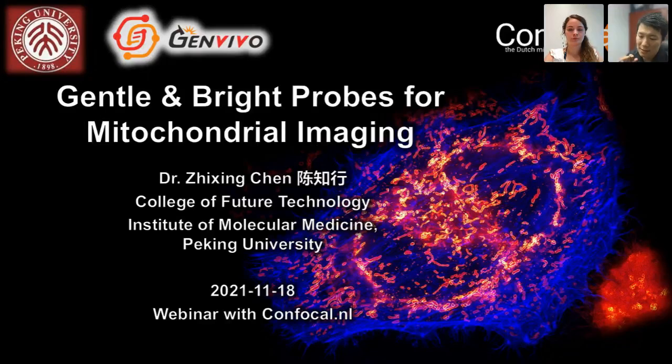If you multiply the extinction coefficient with the quantum yield, you get more than 50,000. So that's phenomenal. In theory, yes, maybe we can find some other dyes that are less phototoxic, but we do not want to sacrifice brightness, because without brightness you cannot even have one frame of super resolution imaging. That's why we chose to start with cyanine dyes. I don't know if this answers your question, but that's a very good question. I think so.